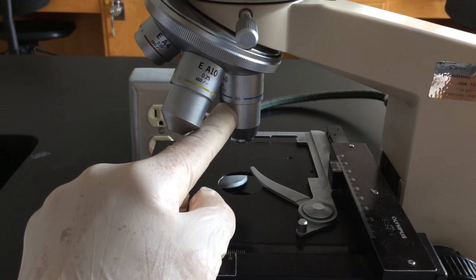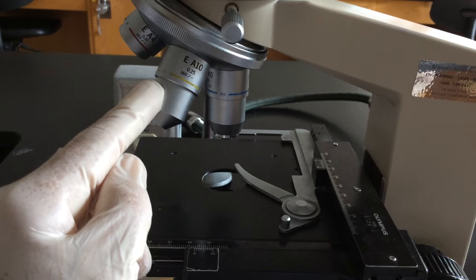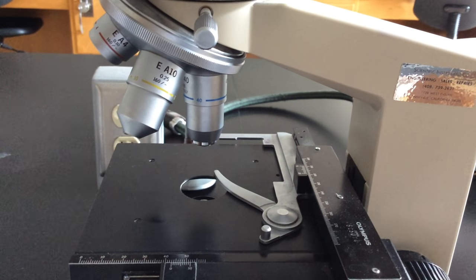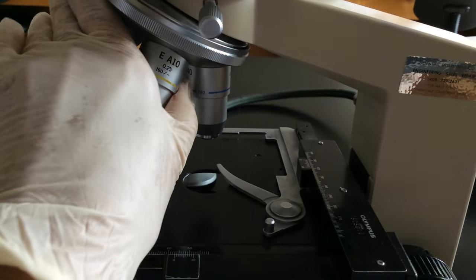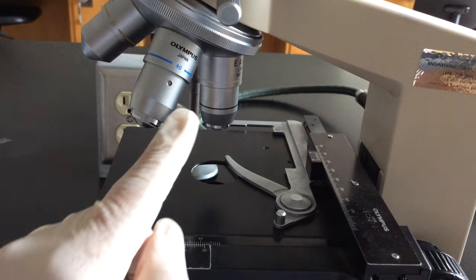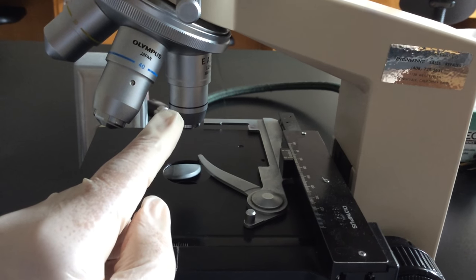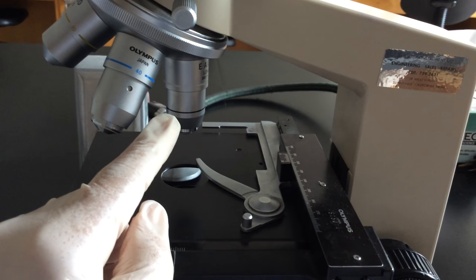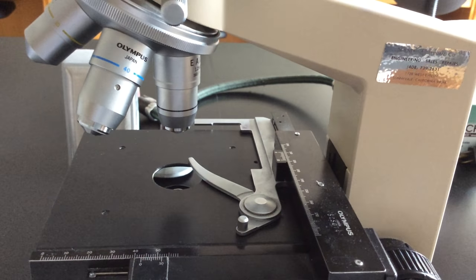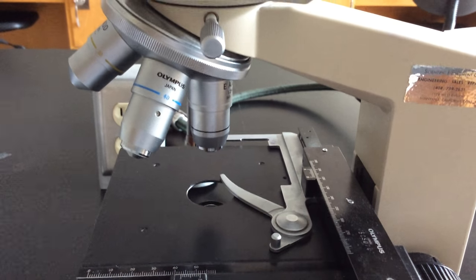Now, we never use immersion oil on the 40x lens, nor on the 10x lens, nor on the 4x lens. We only use immersion oil with our most powerful objective, and that is our oil immersion lens. And here, that black band is a symbol that we're going to be using immersion oil on this, our 100x lens, or oil immersion lens. And again, we see how long it is. We only use the fine focus adjustment knob with our oil immersion lens.